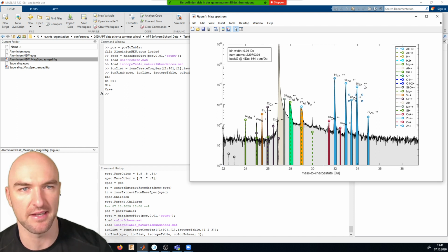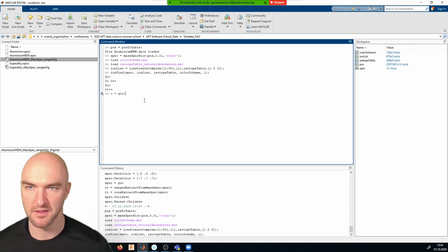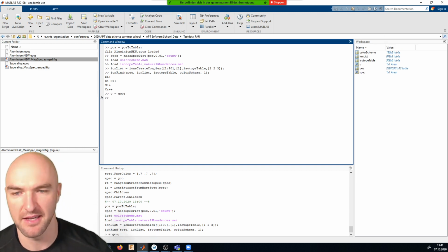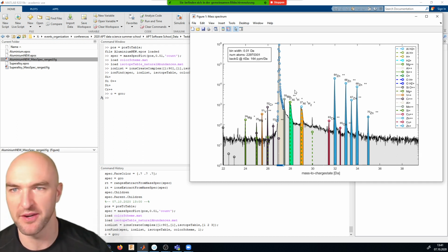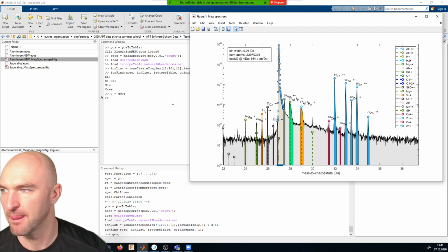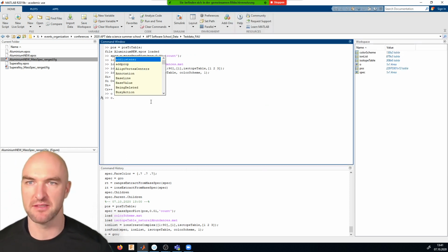You can select the text, which is not that useful, but you can select, for example, the stem plot. Okay, with the same color, it's a little bit hard to select. Now I've selected the stem plot of the ion, but I'll just show you what you can find in there. Then I've made that range plot my current object. Do you all have the range figure open? Okay. And so in this object, I can dive as deep as I want.